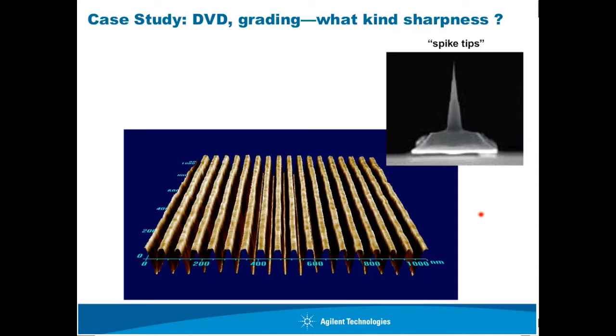That's my way to deal with very strong static force. I haven't tried it, so at this point it is a suggestion. If someone happened to have this sample, we should have a chat, and maybe I can try this suggestion, so that one sharp tip can last more than one sample. This is a very interesting question, because I faced the exact same problem.